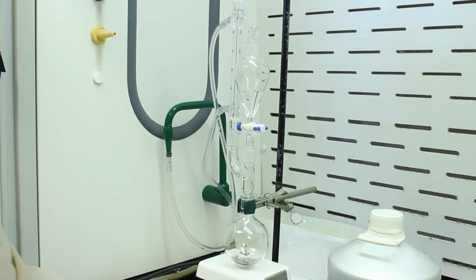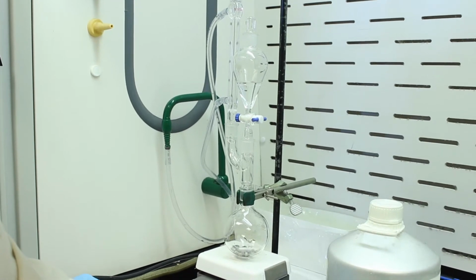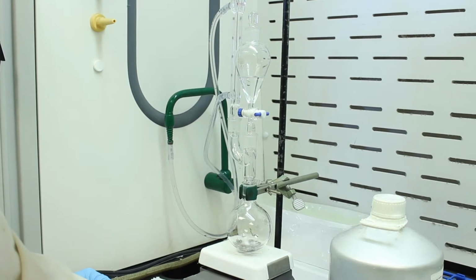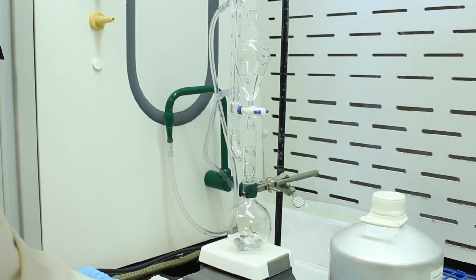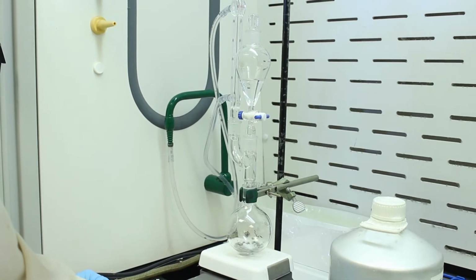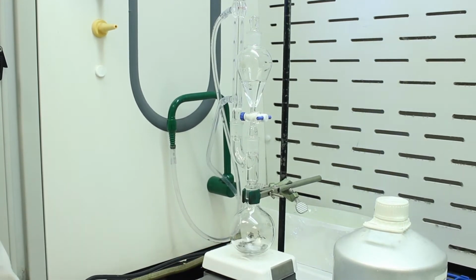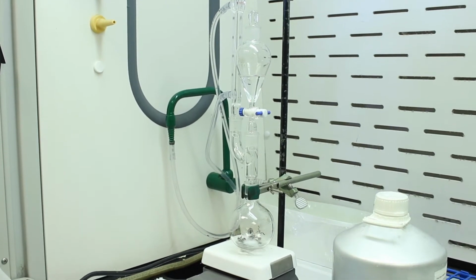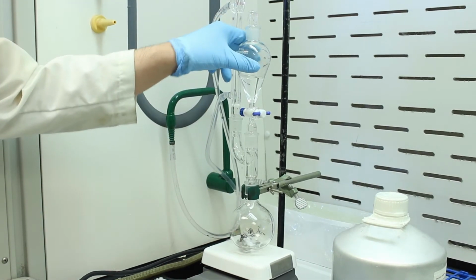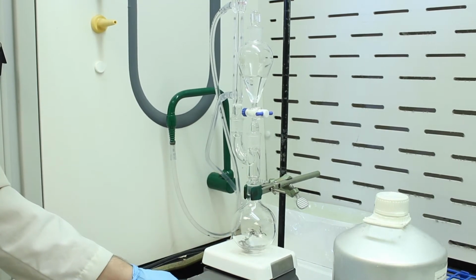So we'll add the stir bar. The stir bar helps agitate the magnesium, helps it to react. And this is perhaps the hardest part of the Grignard, to get the reaction going. Many chemists struggle to get this reaction going. It's pretty finicky sometimes. A good indicator that it's occurring is that you'll see the solution turn sort of turbid, sort of light gray, perhaps a little light brown, and it'll start to fizz and in fact reflux in here. Okay, so I'll let it go for a few minutes and we'll see, hopefully it starts.